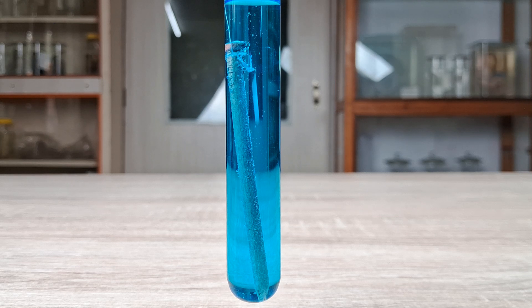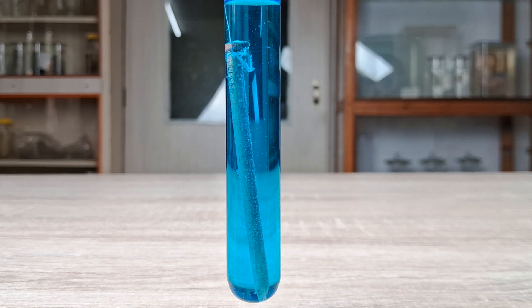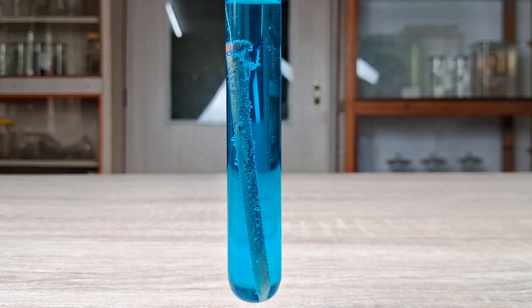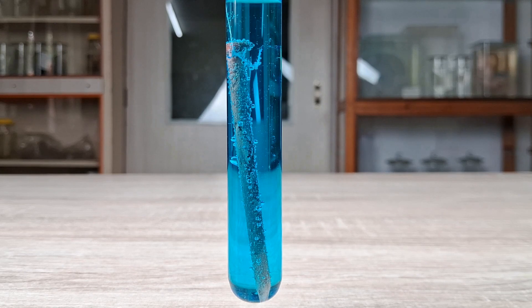Observations: A few minutes after lowering the iron nail into the blue copper sulfate solution, bubbles begin to form on the surface of the nail and the shiny gray surface begins to tarnish into a brown to reddish-brown color. If you allow the reaction to proceed for several hours, you'll notice that the entire surface of the iron nail becomes coated with a rich deposit of a reddish-brown layer.